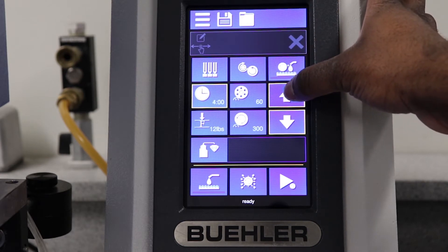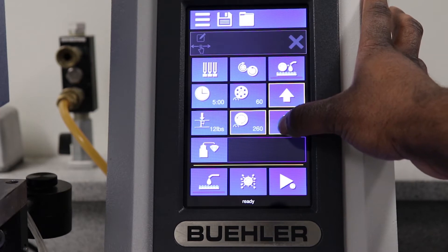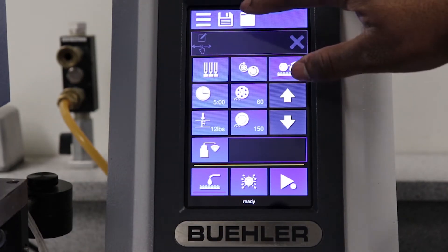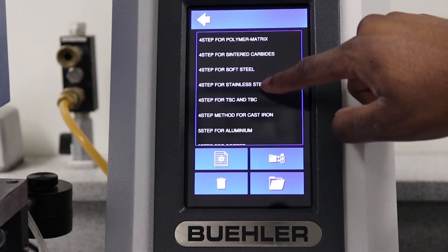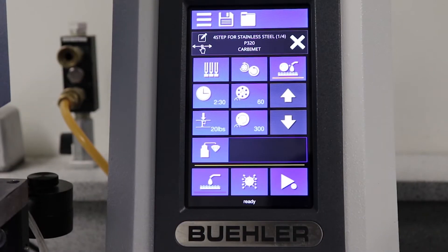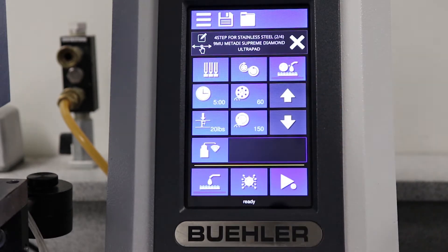The Pro Model's touchscreen controls make setting parameters quick and easy. Pro Models come preloaded with Buehler's recommended methods for the preparation of a wide variety of materials. Users can quickly swipe between method steps for easy process setup.